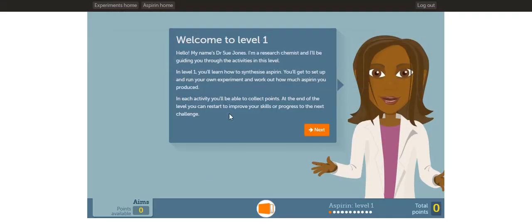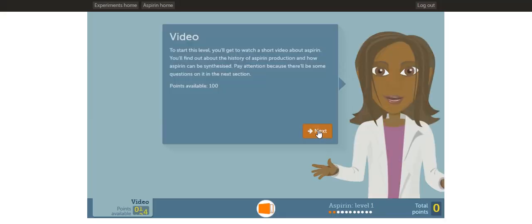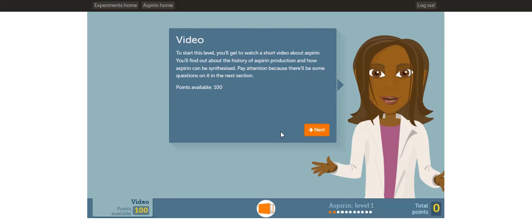Now we can begin the virtual lab. Take a moment to read this text box. This lab is about synthesizing aspirin. Once you've read this text box, click Next. At the start of this level, you'll first watch a short video about aspirin. The video will be about the history of aspirin and how aspirin can be synthesized. Pay attention to the video, because there will be questions about the video afterwards. Once you're ready, click Next to watch the video about aspirin.